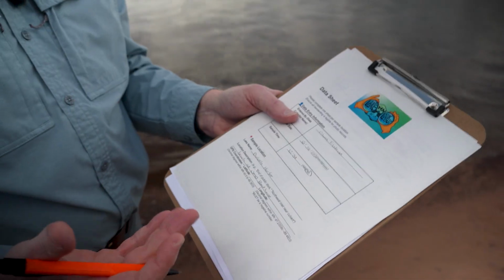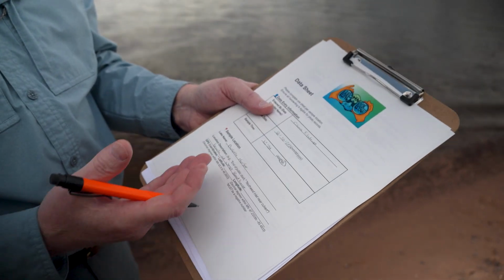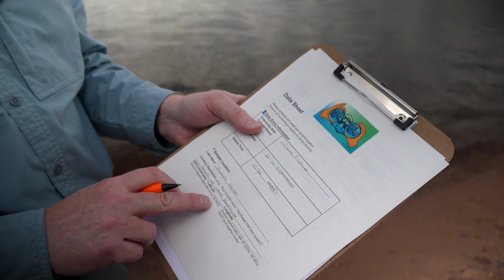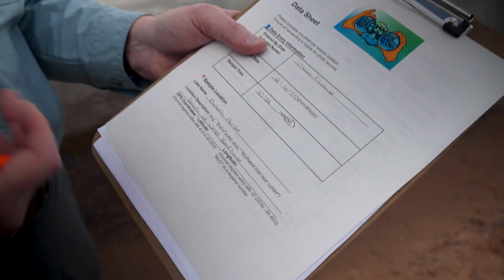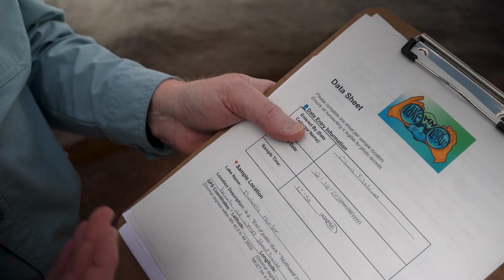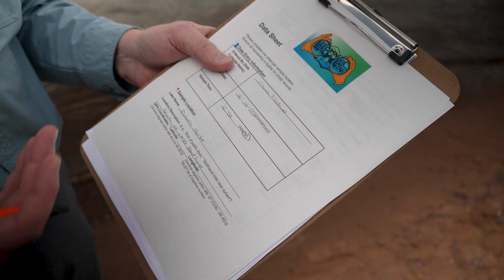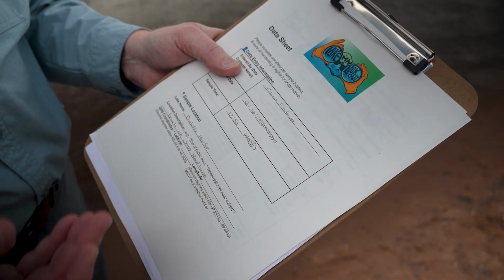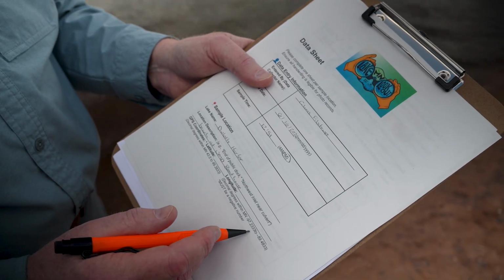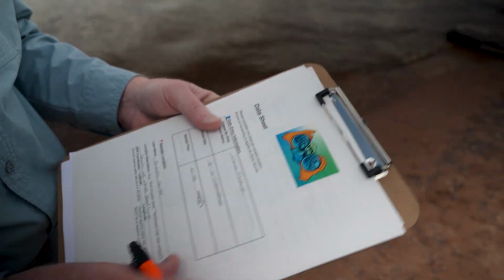I would take out my cell phone right now and just open Google to figure out what my lat and long are, and I would record those there. And there's very nice descriptions of what valid numbers are for your latitude and longitude, because right now this project is only within the state of Minnesota, so our latitude will be between 43.5 and almost 50 degrees north. And we will have a negative longitude number because we are in the Western Hemisphere.